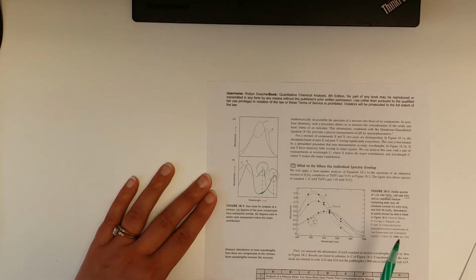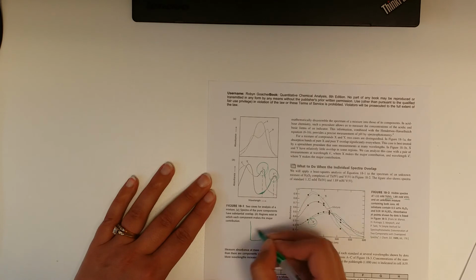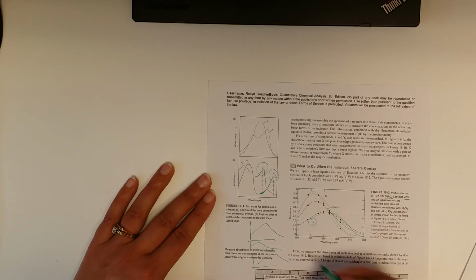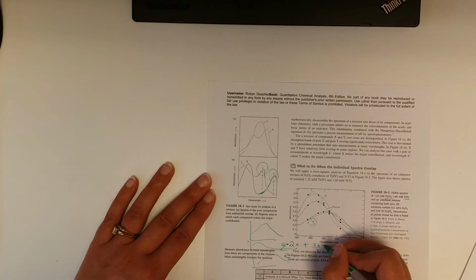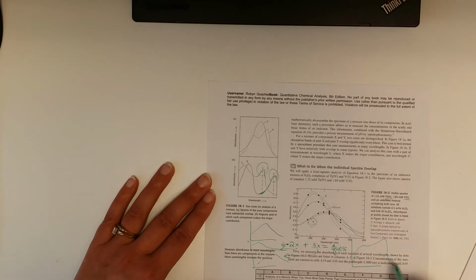And what we do is we guess. So the math that goes forward is purely about guessing. It's like, well, I've got a blob that looks like that. And I know that one component is this, and one component is that. If I just arbitrarily say, okay, 2 times that plus 3 times this, I'm going to get some spectrum. So this is a guess. And you can plot that, and the guess will be like, okay? Not perfect, not what this is, but it's a guess.